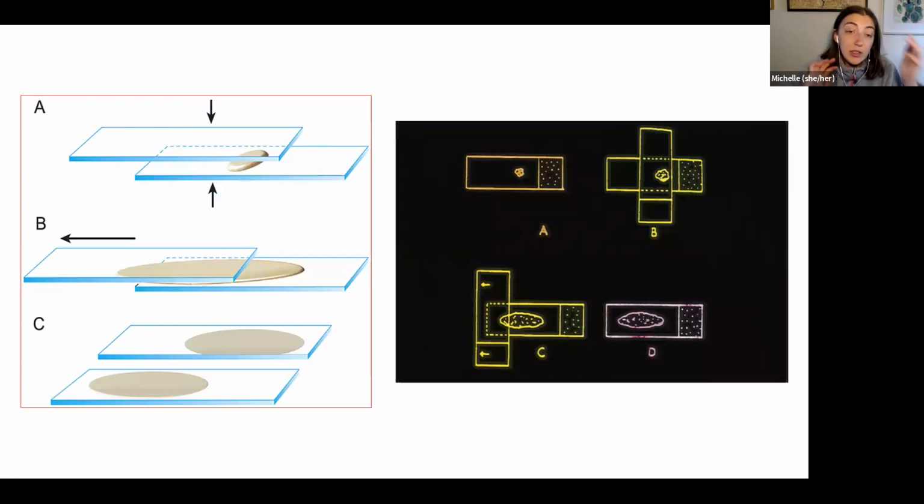I really, really encourage you to smear your samples like this. You put your sample on one side, gently lay the other side on top of that sample, let the sample squish down, and then pull the sides apart. Sometimes when you do them parallel like that, they'll vacuum together and can break the cells. So if you do them perpendicular, that's a little bit more gentle.